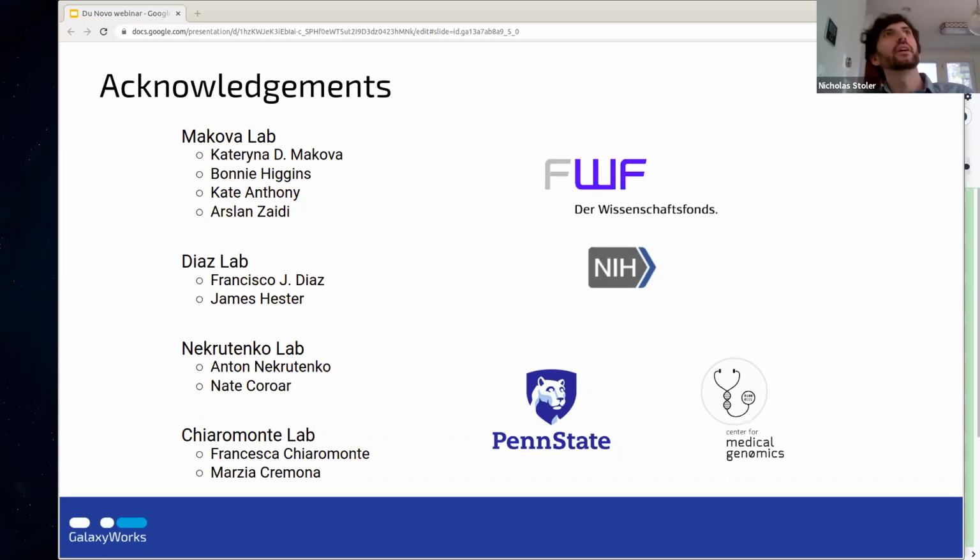Yeah, it depends. I'm trying to remember some specific tools, metrics that you get from some of the tools that Irene created. The general benchmark I have is, like what I was talking about before, if there's a lot of ambiguous bases, it's worth investigating. That's what I'll say.